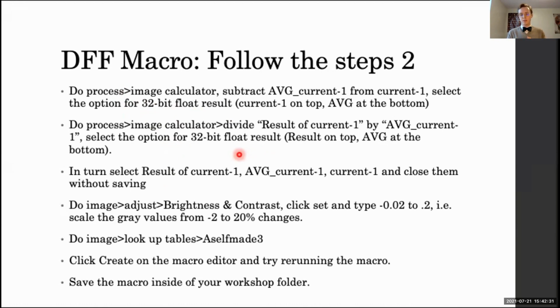I'm going to walk through this soon, so perhaps you can try again while I am walking everyone through the process. For image, you should go to Image, Adjust, Brightness and Contrast. Have you gone to Adjust first? I think the problem there might be that too many images were closed, but maybe we can catch this on Keegan's walkthrough of these steps.